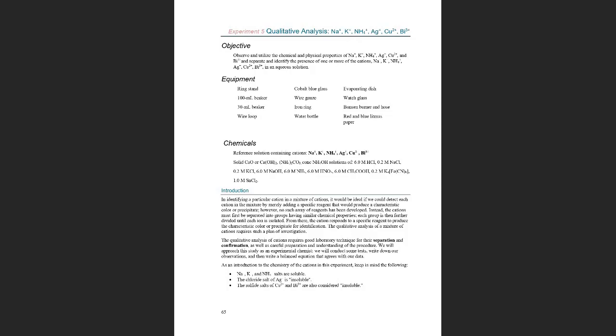and how much. In your case, in your first experiment, you will have a reference sample of these 6 cations. You don't have to guess anymore. You know the periodic table, we have so many elements. But in this case, they're all cations.